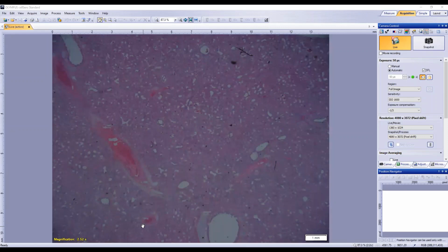In the bronchioles, we would look first at the lumen, whether it has anything in there, presumably mucus, fibrin, or exudates. Then in the epithelium we would look for pseudostratified epithelium, whether it has the cilia intact or there is some metaplasia or not.